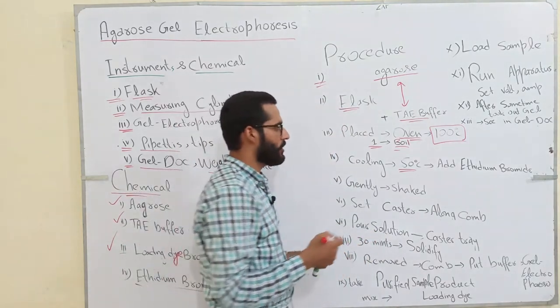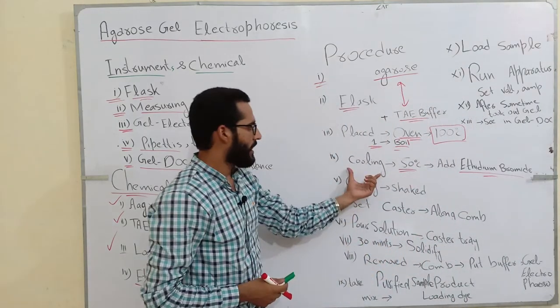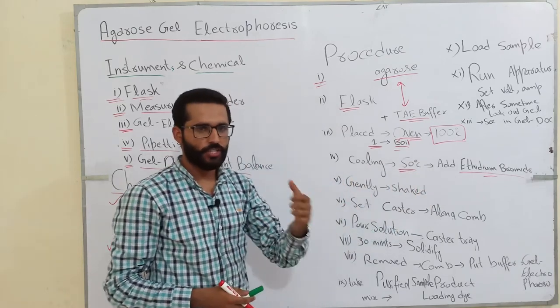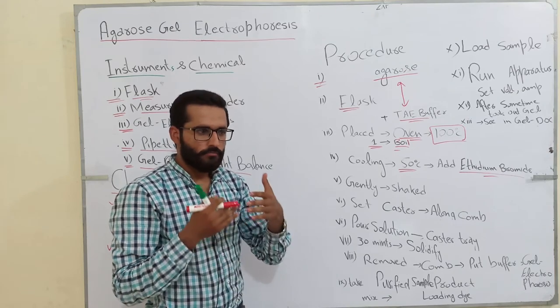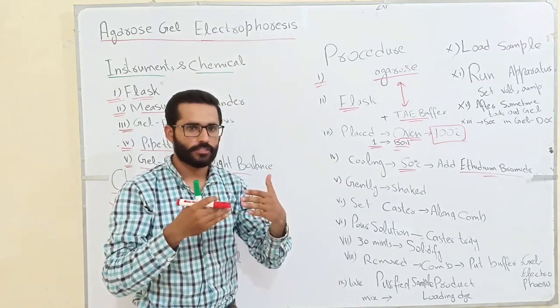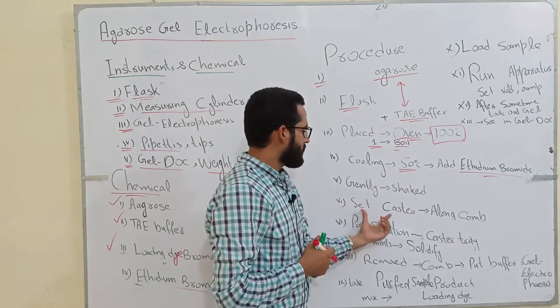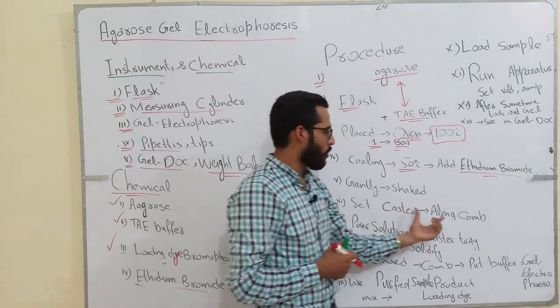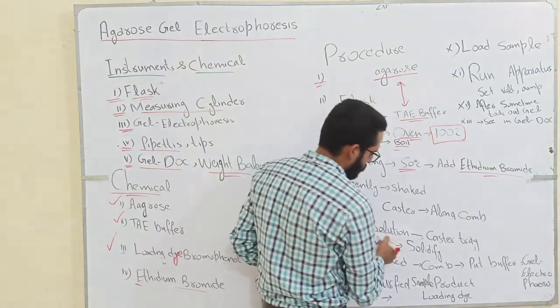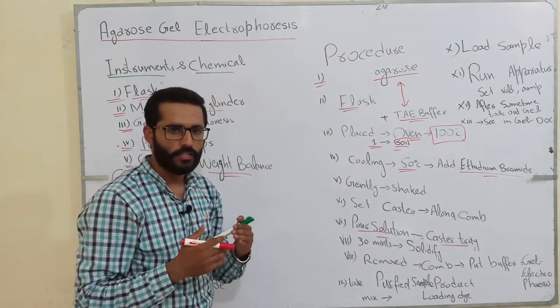When we add ethidium bromide to the flask, we gently shake the flask so that the agarose gel does not solidify in the flask. After shaking, we set up a casting tray along with the comb and pour the flask solution into the casting tray for solidification of the agarose gel.